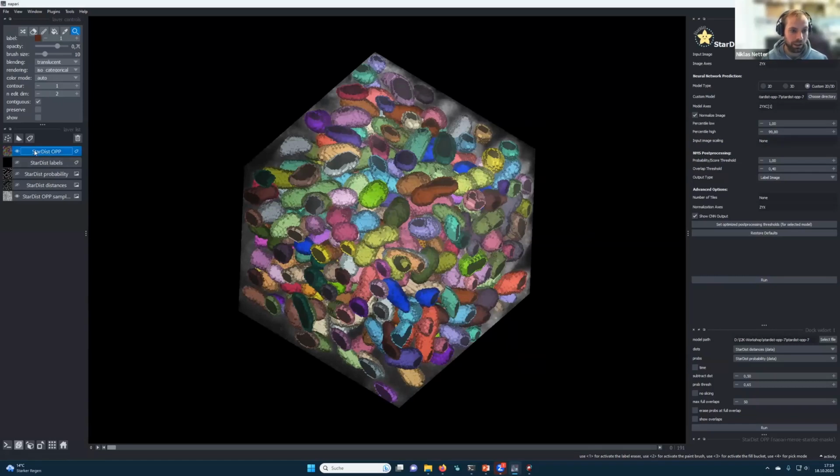So now this is the segmentation mask, and when you want to import something into BiofilmQ by segmentation, you have to regard this segmentation mask as a separate channel, similar to having a fluorescence channel. So we will first save this file as channel 1, because this is our raw microscope image that we also want to import into BiofilmQ.